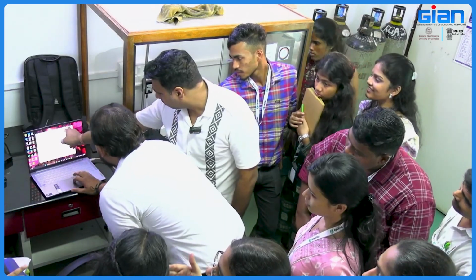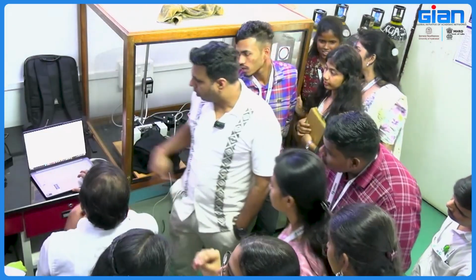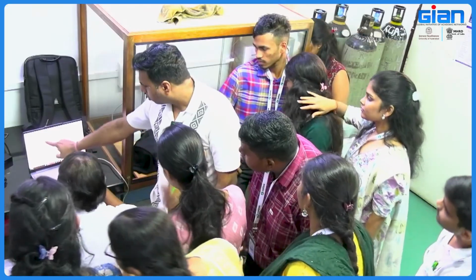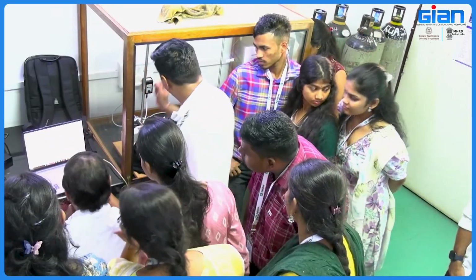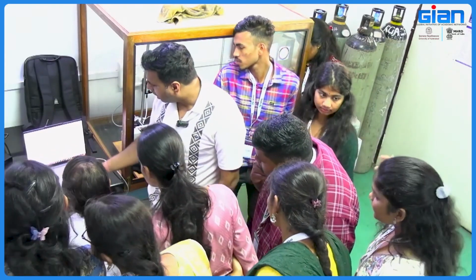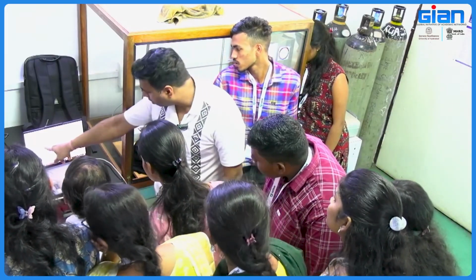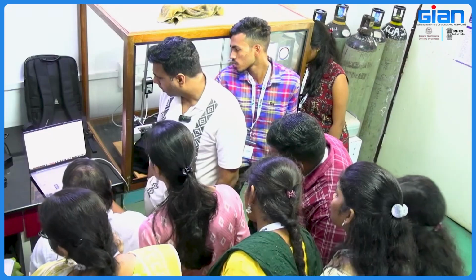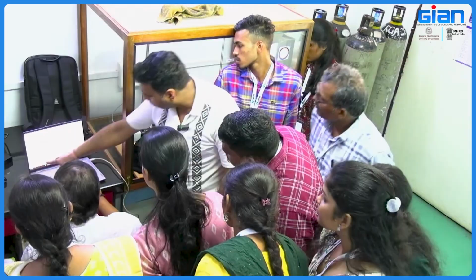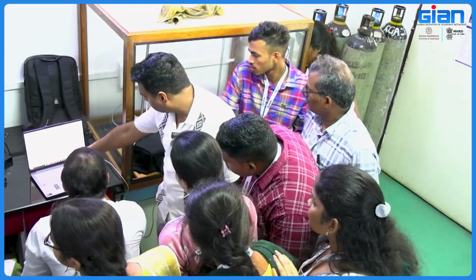Yeah, just maximize it. You can sit. So it depends on what you want to do. Since it is leaves, you can go for Fluo and P700. I already selected it. For the detector, you see DR, this is not connected. Detector 2, you see nothing is connected here, so it is NC, and the rest of the things are fine. Then you have to go for measuring light. Balancing you have to do. Okay, now balancing is done. Once you press it, this measuring light will be on. Now you go to light curve here. Okay, so just click start.